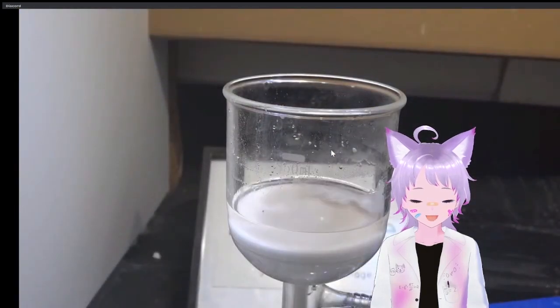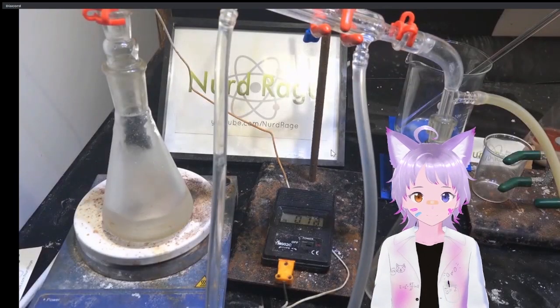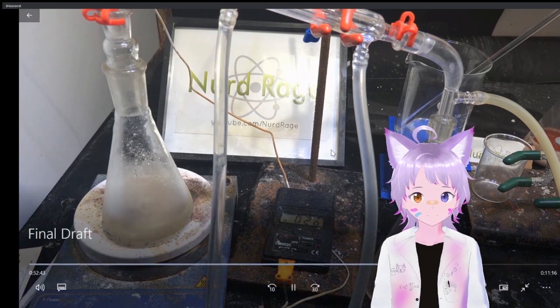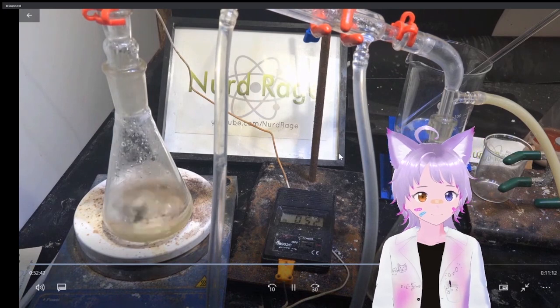Dude, that's some crazy stuff. Now we vacuum distill the solution to get dry guanidinium chloride. Yeah, my vacuum source. And he has to vacuum distill it as well. Think about that madness. Yeah.